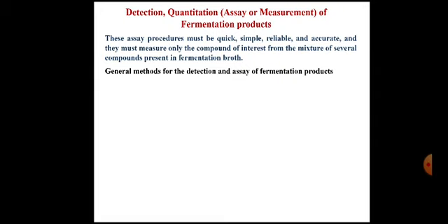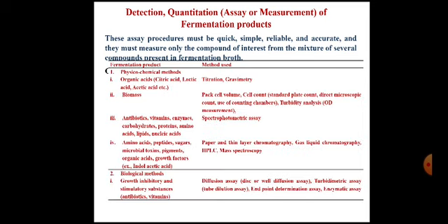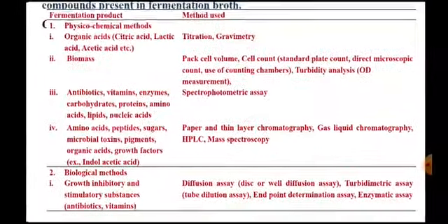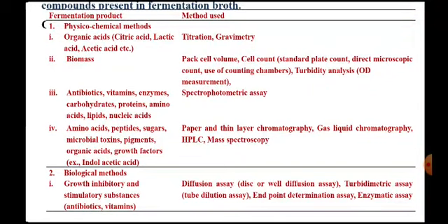There are certain general methods for detection and assay of fermentation products which are classified like this. This is the general chart which shows physicochemical methods.